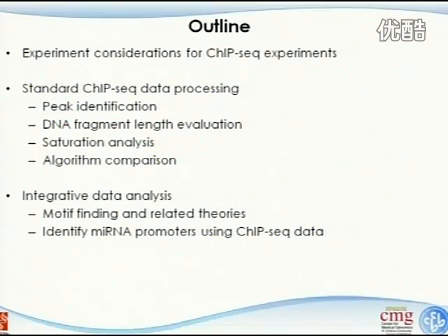And I'm going to give two brief introductions of integrated data analysis. The first one is motif finding and related theories. This motif finding is not directly related to ChIP-seq, but that is the natural step after ChIP-seq.